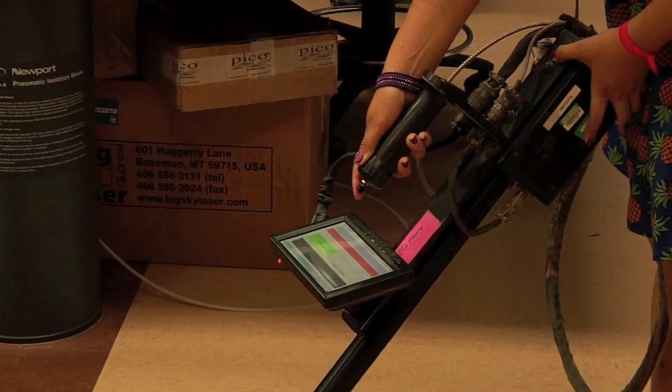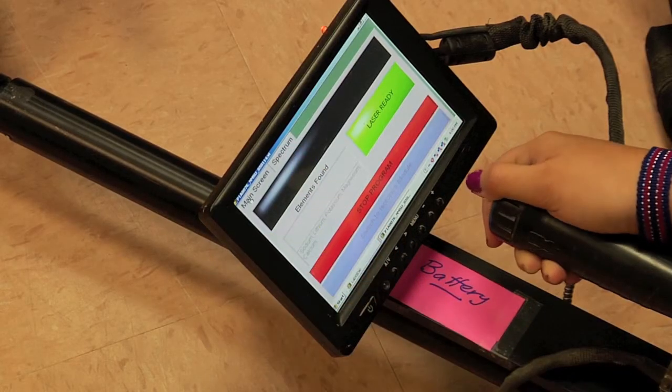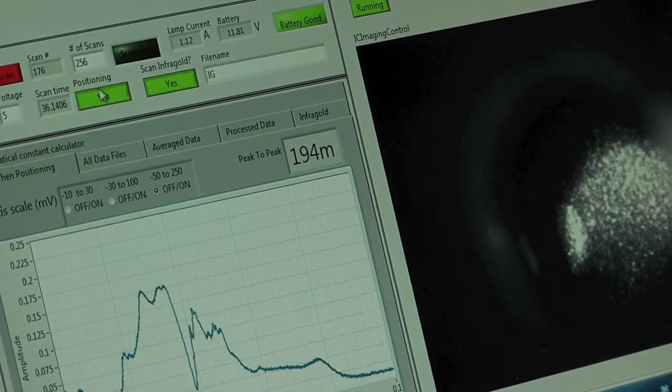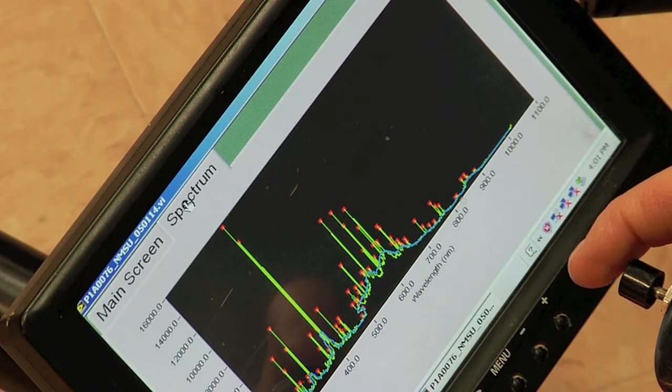The other equipment was laser-induced breakdown spectroscopy, and that has not been deployed in a cave in a backpack model. The two different instruments tell us two different types of things about the rocks that we're looking at. And so the idea is by using the two technologies together, we can gain a better understanding of the nature of those rocks and whether they're inhabited by microbial colonies.